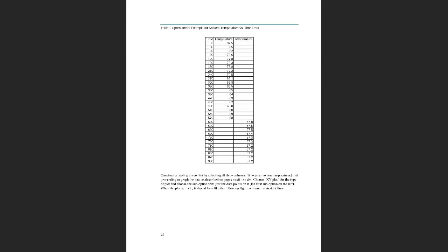So let's look at what I'm trying to tell you. When you are going to plot that data in Excel, the first column is when the temperature drops quickly, with a difference in temperature greater than 0.5 Celsius. The second column is when it drops in a slower way.